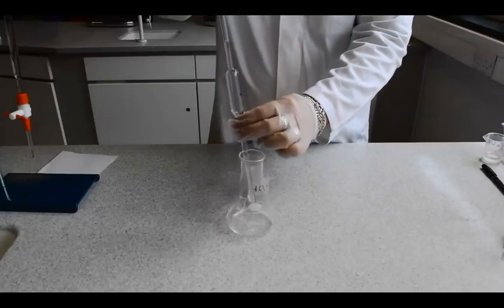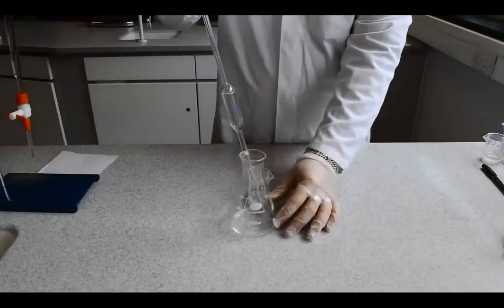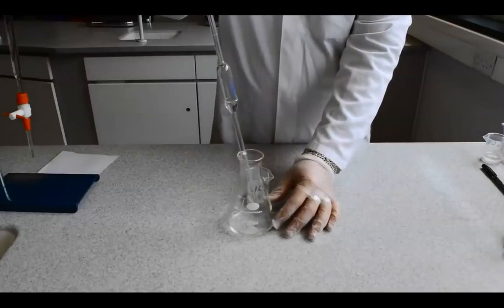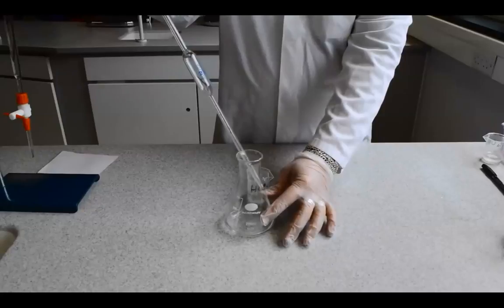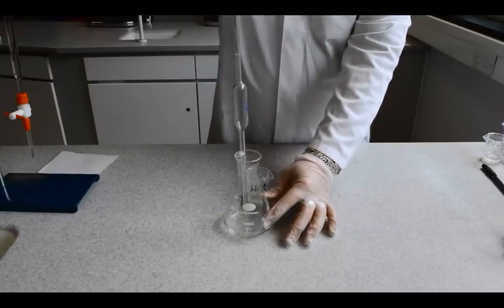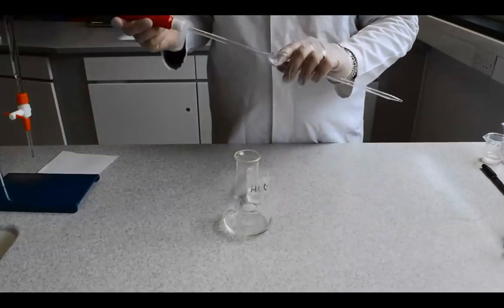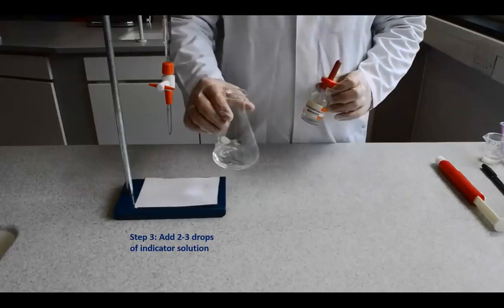The solution is then released. There's a better way of doing this, but this will work. And at the end, the tip of the pipette is touched against the side of the flask and then moved away. The small amount left in the tip is meant to stay there, so that exactly 25 milliliters will flow into the Erlenmeyer flask. The third step is to add a few drops of the indicator solution.